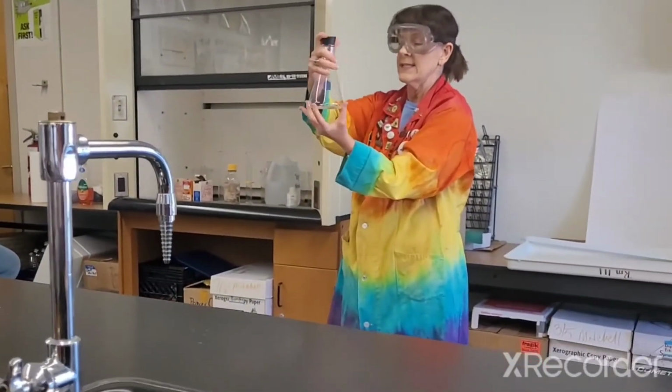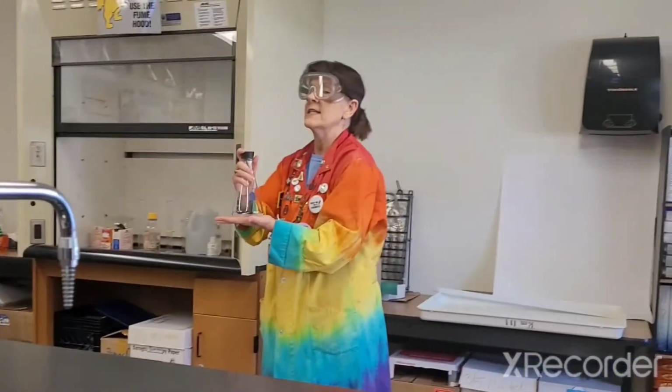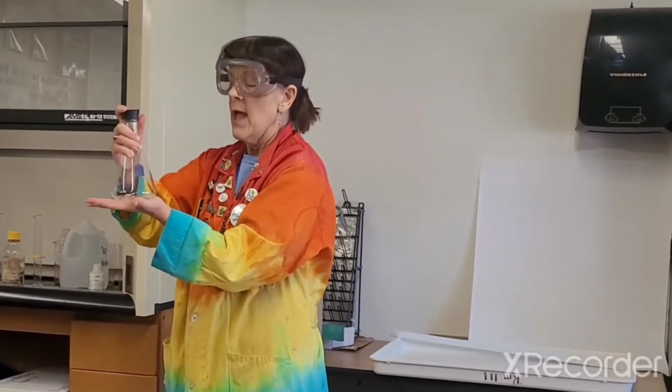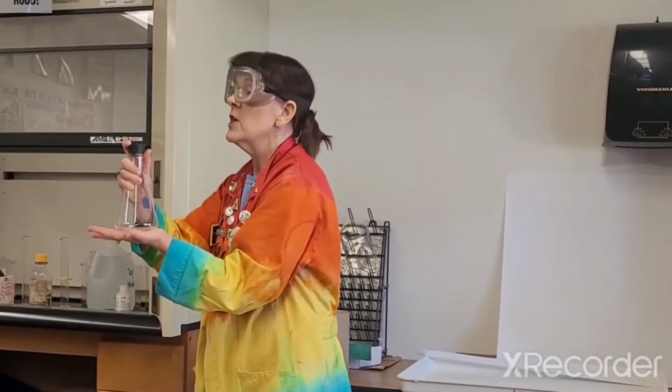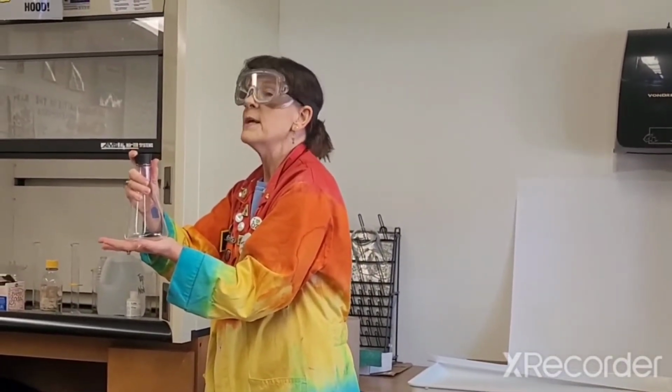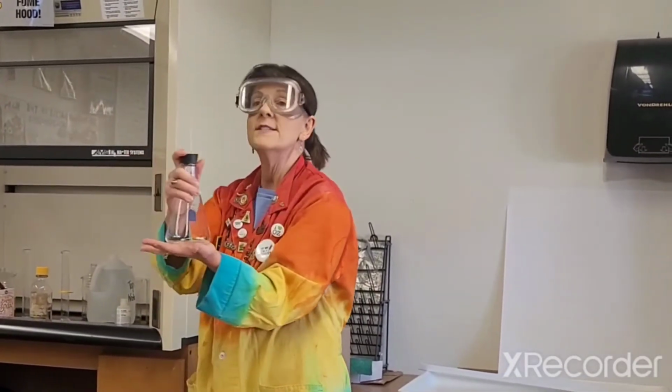Stuff is called hexane, and it kind of does the same thing. My liquid will vaporize. It does not stay liquid very long. In a little bit, I'm going to try to catch it on fire, just to show you that we need to be careful with flammable vapors, because you can't see them, and yet they still might burn.